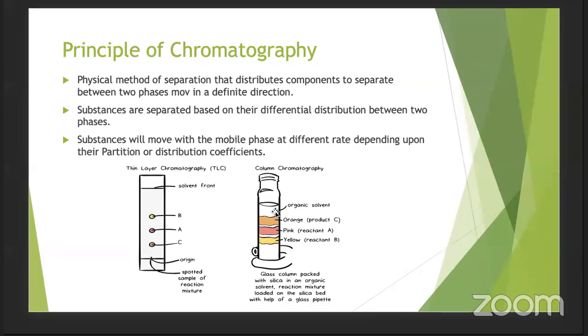When you add your analyte, the ions that are present in the analyte replace the ions that are already present on the resins, and they bind themselves in their place. So they basically replace the existing ions. And when you change the buffer conditions, the components that you wanted to separate that were bound to the stationary phase get eluted, and this is how you do the isolation and separation in this case.